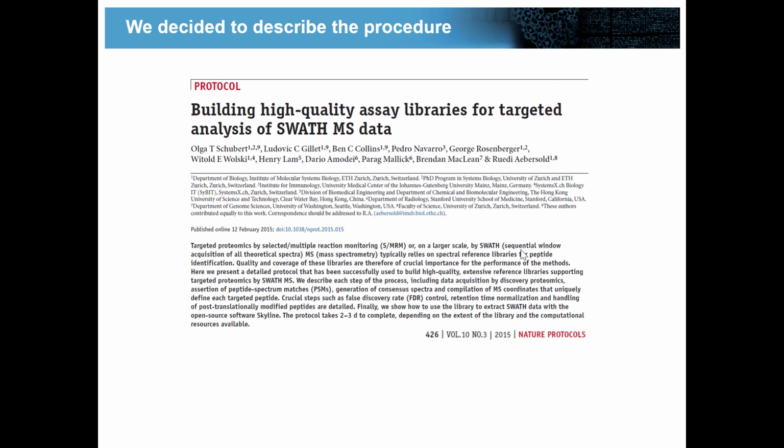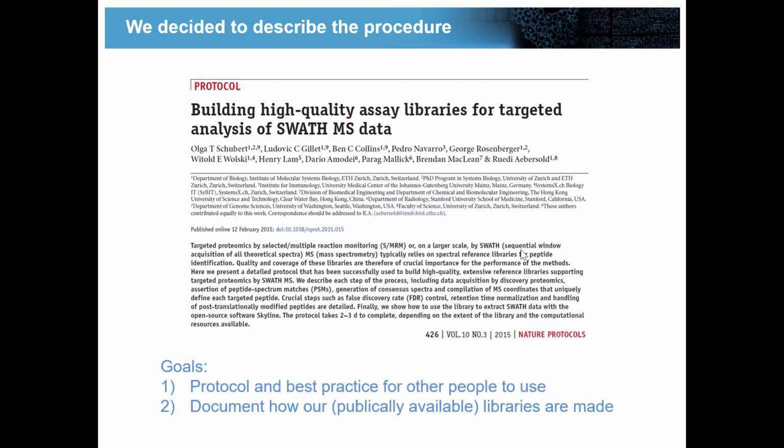I'll try to point out from a high level some of the important features, although we're now running out of time, but we can finish the rest of it tomorrow. If you're interested in this topic, I would encourage you to take a look at this protocol. The goal for us was to document what we thought was the best practice for these libraries at the time, although things have probably moved on a little bit by now. Also, if we were going to put spectral libraries out into the public, we would be able to document how these were made.